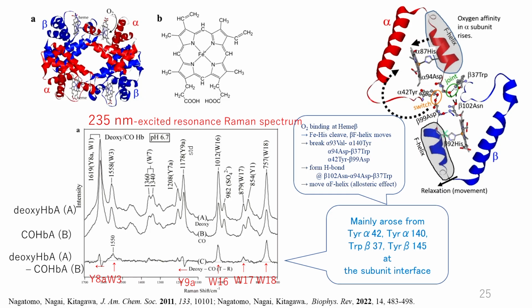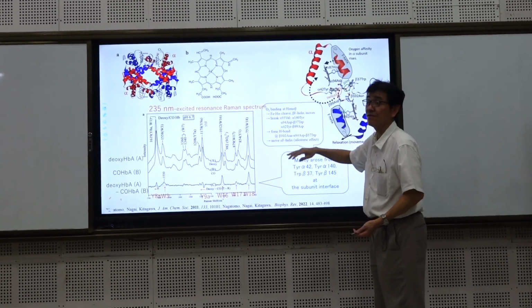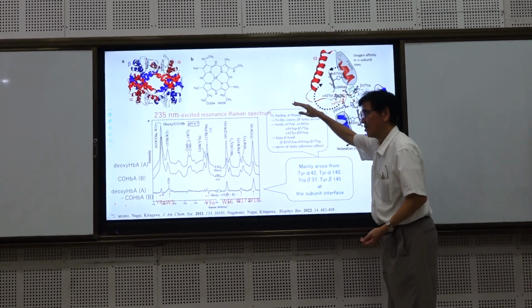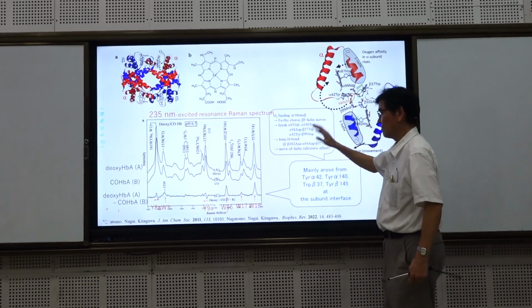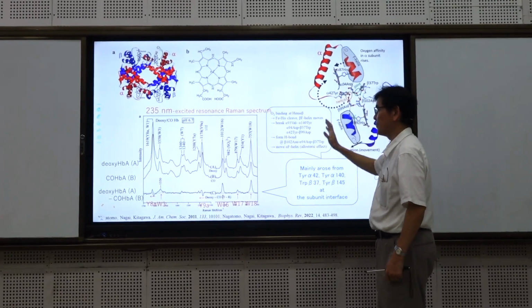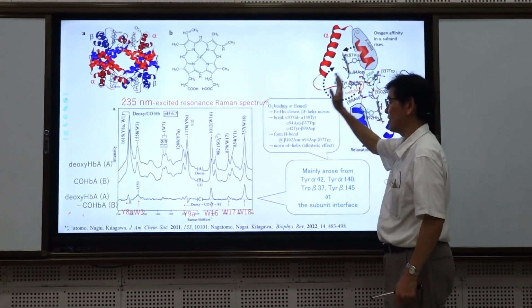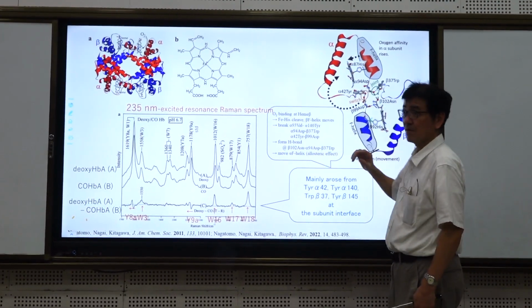By checking the absorption spectrum, you can find the one-photon allowed transition, and that is available for resonance Raman enhancement. So first, we check the UV-visible absorption and identify which chromophore gives which absorption peak.